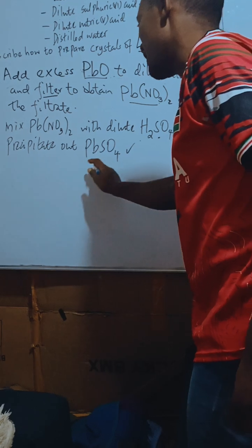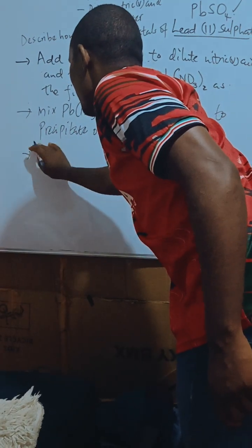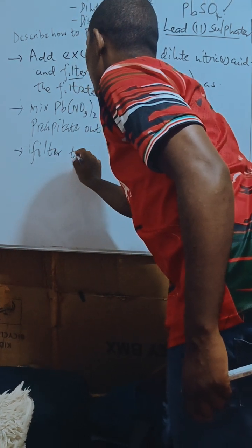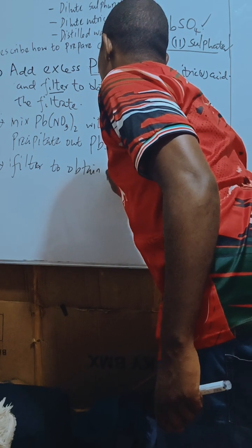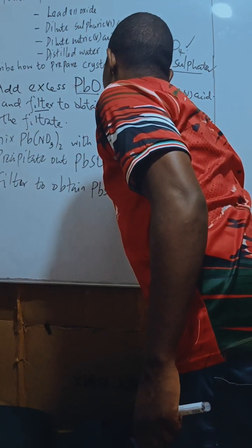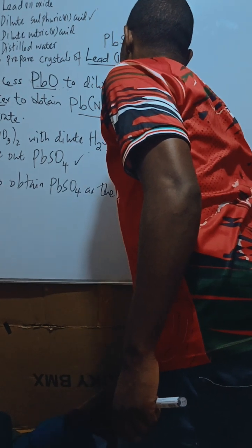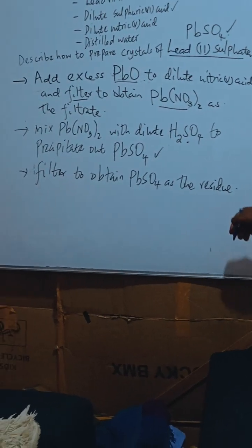After precipitating out lead sulfate, you filter to obtain lead sulfate as the residue.